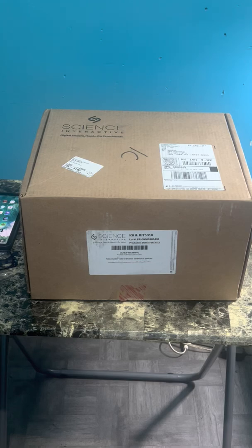Hi guys, so today I'm going to be unboxing my Science Interactive kit from Science Interactive online. I am taking an anatomy and physiology course for three credits in theory and one credit in lab. This is the lab kit — if you do this, you don't have to take it in school.